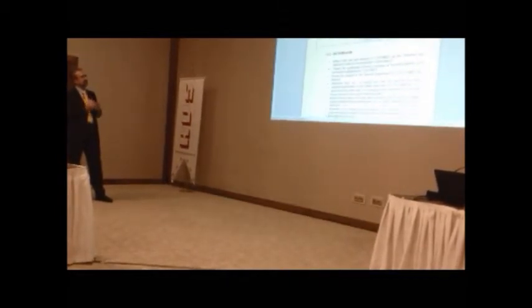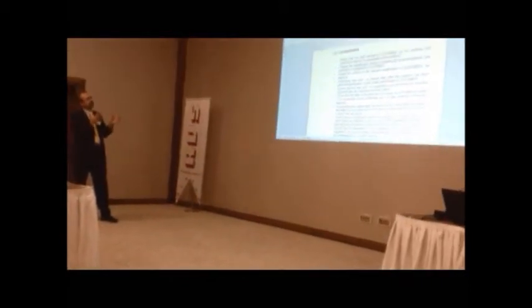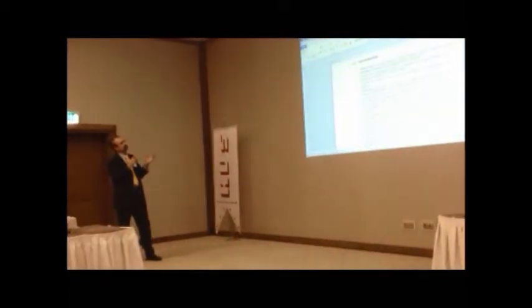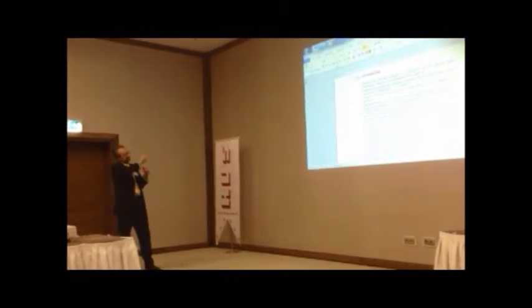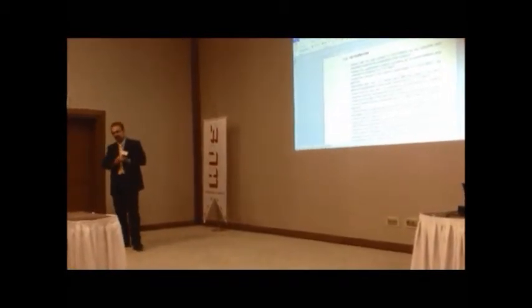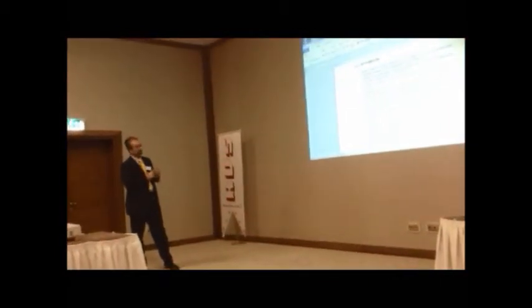Begin the interaction with you for the preparation of the protocol, preparing the qualification protocol, including recommendation and correction, submit the protocol to the relevant qualification person of the customer for approval, performing tests or checks only after the protocol has been approved. Only after the qualification protocol has been approved, or you can do it before, but you have to be allowed by the customer. Ensure that our personnel is able to perform this test.